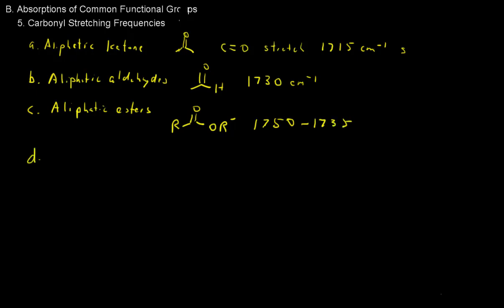Similarly, amides absorb at lower frequencies, and there's a reason for that. You have a pair of resonance forms in amides that lengthens and weakens the carbonyl bond.